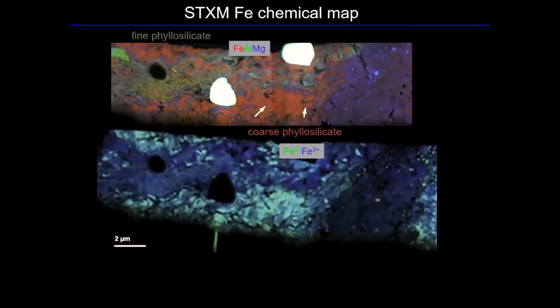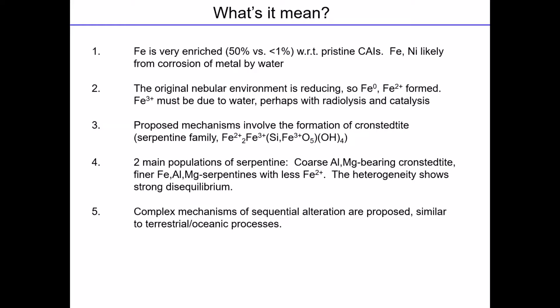All right. Matt Newville, you had a question? Yeah, for these meteorite samples that you were talking about, there being basically a chance of weathering, was any sulfur work done on those? Any sulfur work? You mean like sulfur XANES? Yeah, speciation. Not that I know of. But of course, there's been so much meteorite study, I imagine that somebody must have done it. Right, and that would just help decide whether it was weathering or something more. You mean like whether you see sulfate? Yeah. I don't know whether they even looked for sulfate in this case.